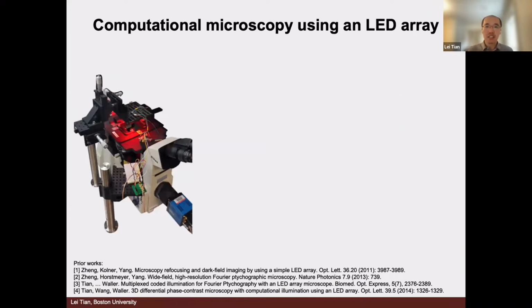Like I said, the setup is very simple. Let me walk you through this. Basically we have a standard microscope, and this microscope can be anything. This is just set up in my lab. But in general, if you look into this topic of LED array microscopy, quite a few groups have worked on it, initially Changhuei Yang's group at Caltech, and later I did extensive work during my postdoc with Laura Waller at UC Berkeley.